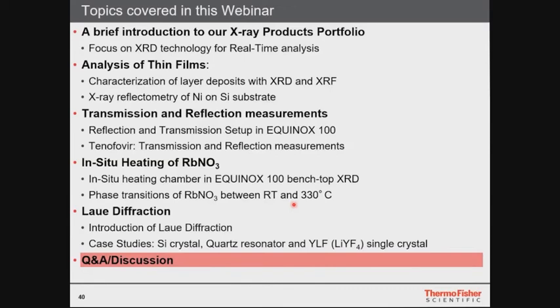Thank you, Simon. Our last question for today seems to be related, but you can probably throw more light on that. Are we able to perform low angle measurements at less than 10 degrees using XRD? Yes, of course. As I mentioned, there are specific SAXS instruments where you can measure down to, I don't know, maybe 0.1 or even below 0.1 degree 2 theta. What we can do is, depending on the setup, we can measure down to something like 0.5 degree with a big floor standing instrument, and the bench tops can reach something like 1.5 degree 2 theta.